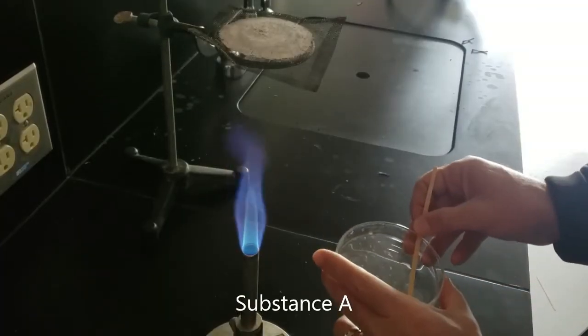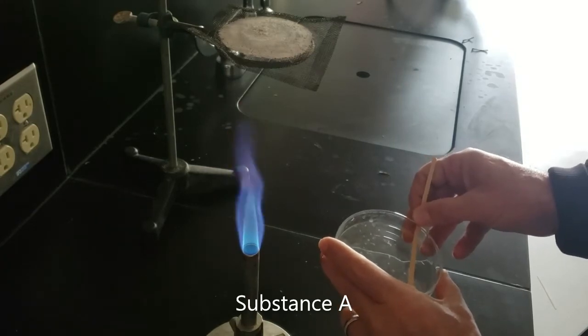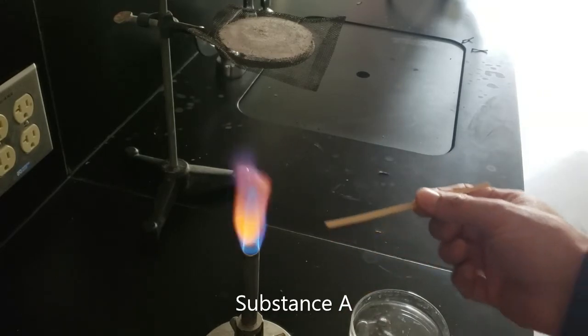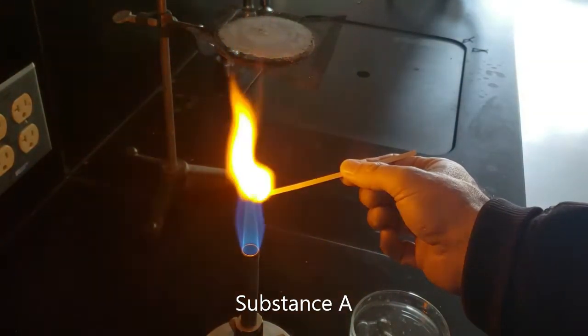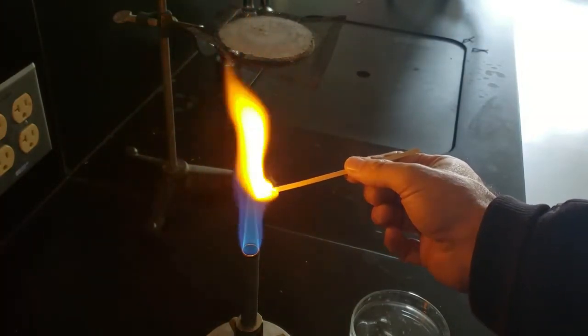All right, so now I am soaking my wooden splint in the unknown solution there. And I am going to do the flame test now. And we get a bright yellow flame out of this one. This one is compound A.